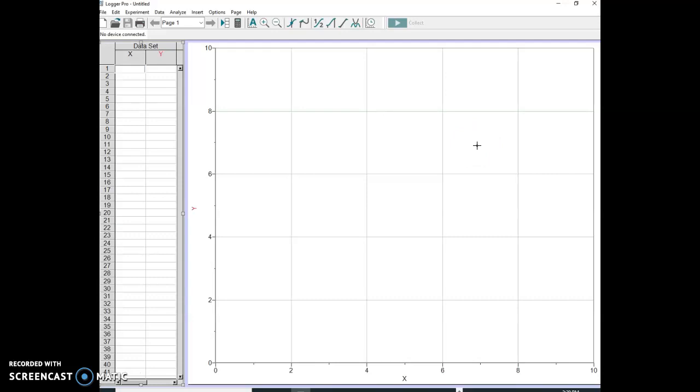And of course, your conclusion is going to say what order the reaction is in crystal violet. You get that from part 1. And you might want to report what the rate was, what the slope was. And then also the second graph gives you part 2. And if you get a straight line, it's first order. If you get a curved line, it's second order in part 2 for hydroxide. That should take you all the way through your lab report.